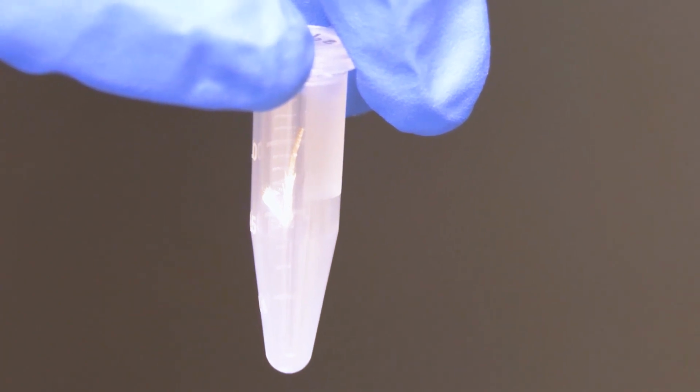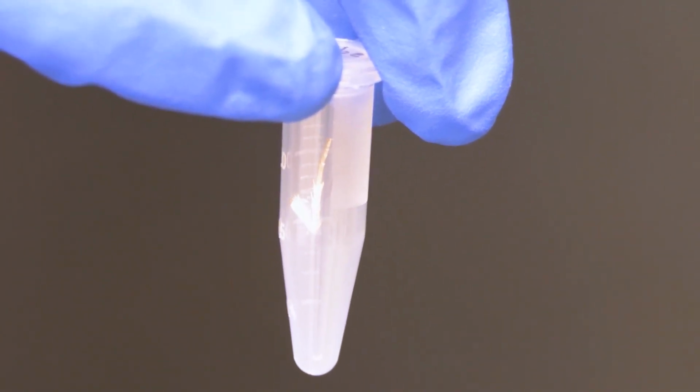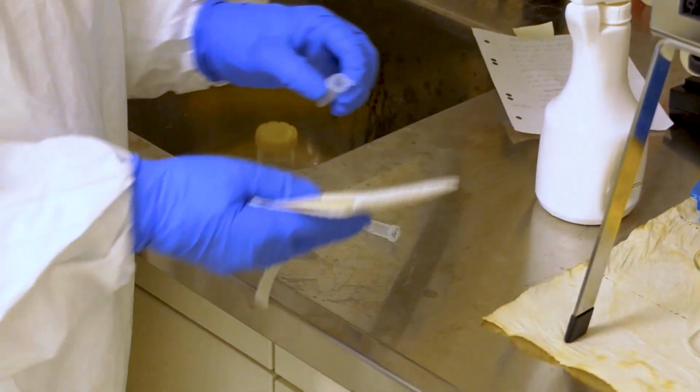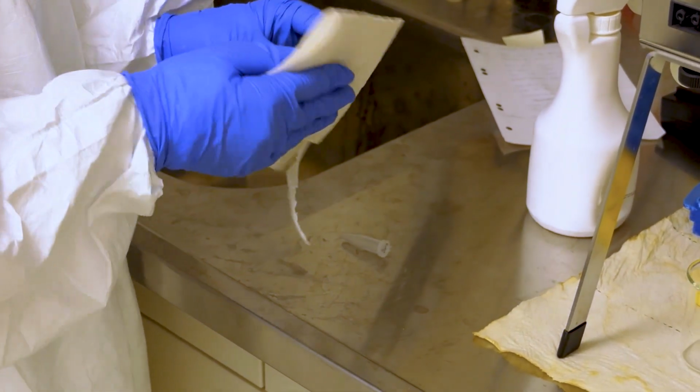Tissue samples should only be introduced into the facility in a sealed container. Lepidoptera legs can be easily transported in tubes. Always clean tubes containing your samples by using DNA Away or similar before introducing them into the hood, as exogenous DNA may stick to the tubes no matter how carefully they were handled before.